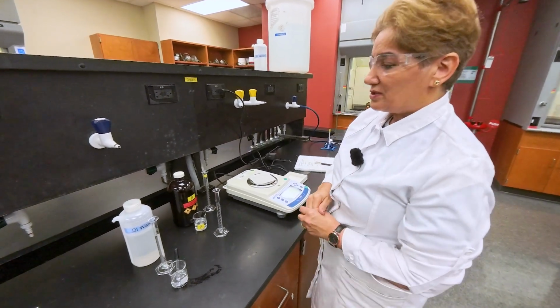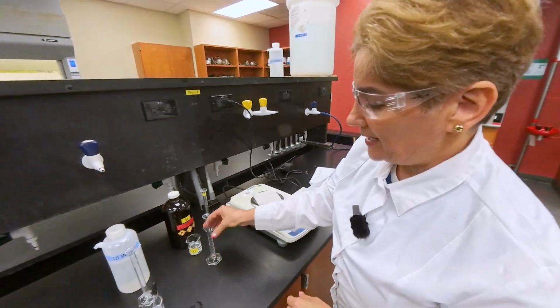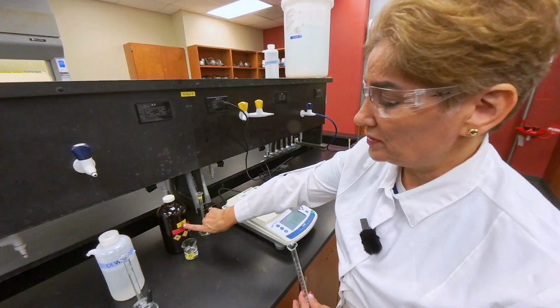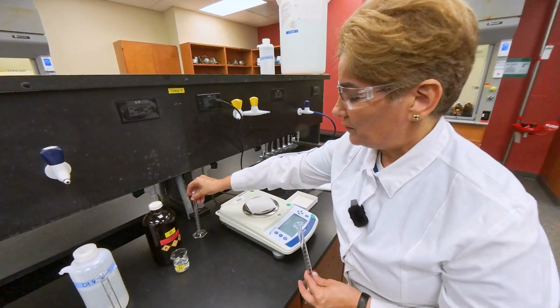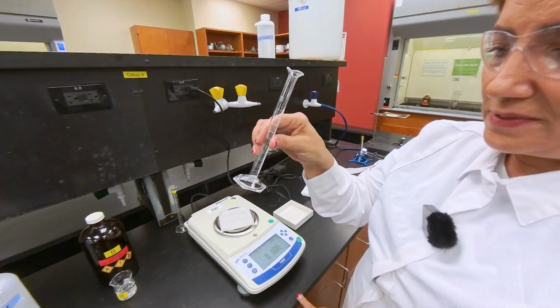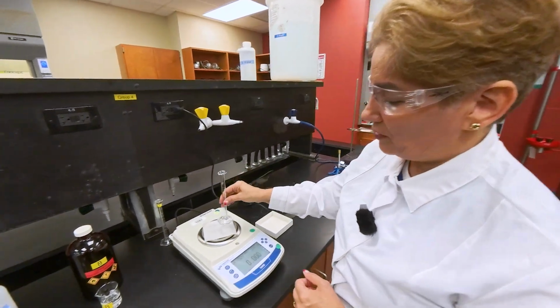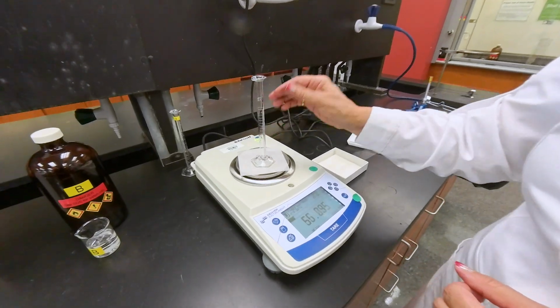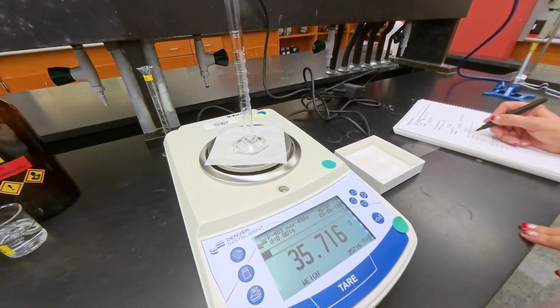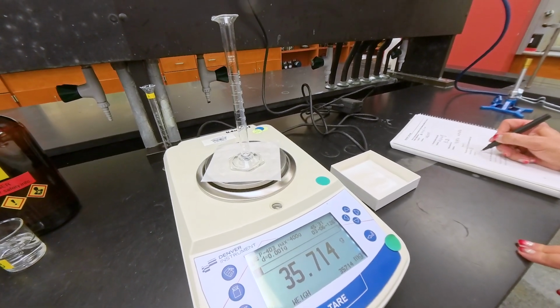Not every liquid is going to have the same density. We are going to measure now the density for an unknown liquid. Note that it's unknown B for this part of the experiment. So again, we are repeating the same procedure because it's a liquid. I'm going to have the mass of the empty graduated cylinder and record that number carefully.